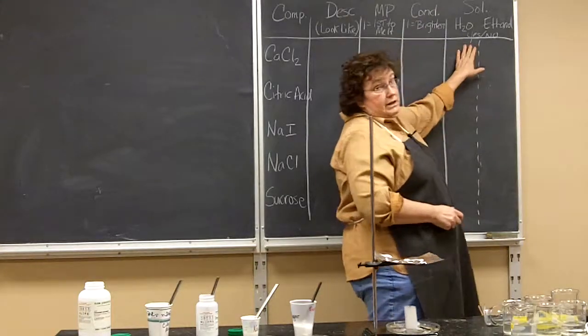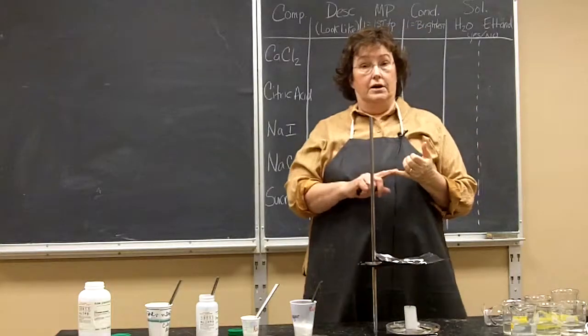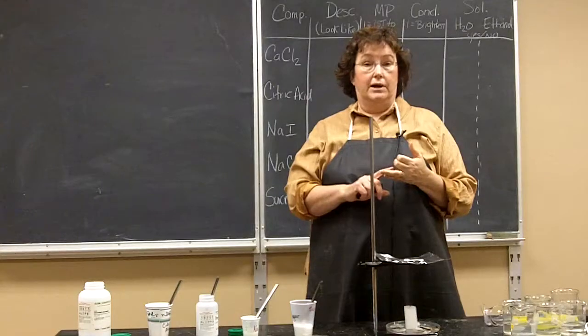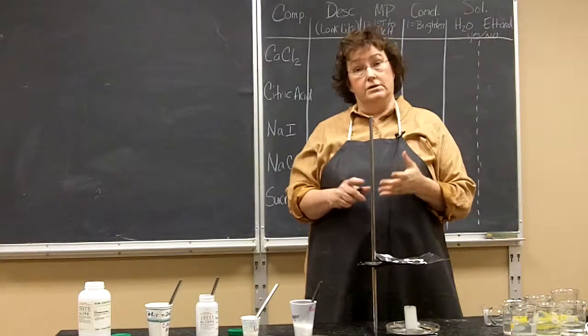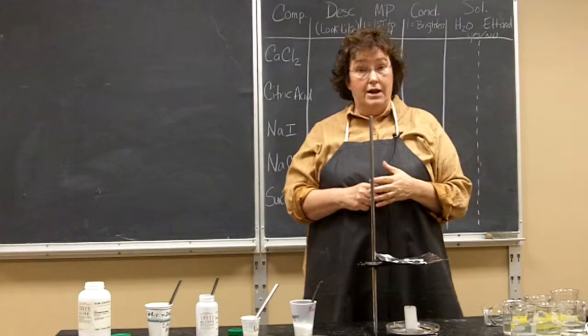The final test is, what does it dissolve in? Does that compound dissolve in water? Does it dissolve in ethanol, which is a type of alcohol? Or does it dissolve in both? Or does it dissolve in neither?